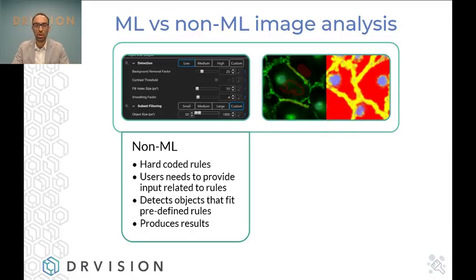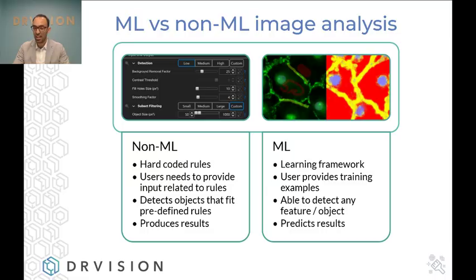In other cases, where the images are a little bit more complex, more challenging, or there is a lot of noise, and we'll talk about the examples, then it's very hard actually to do the segmentation using straight non-machine learning algorithms. And it helps a lot to have either a preliminary step where you enhance the image, or a whole pipeline where you do the enhancement and the detection and the filtering all using a machine learning environment.